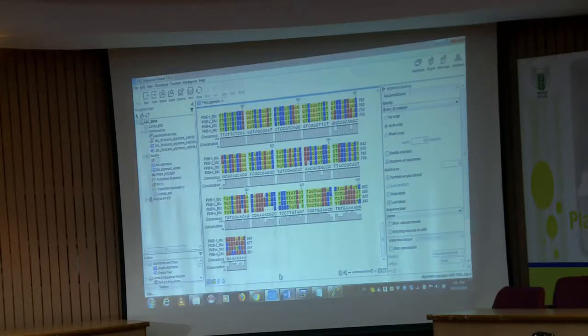Now all the 4 sequences are normalized, they start from 1 and end at the same point, right. Then only I can compare if all the 4 have a similar number of bases.